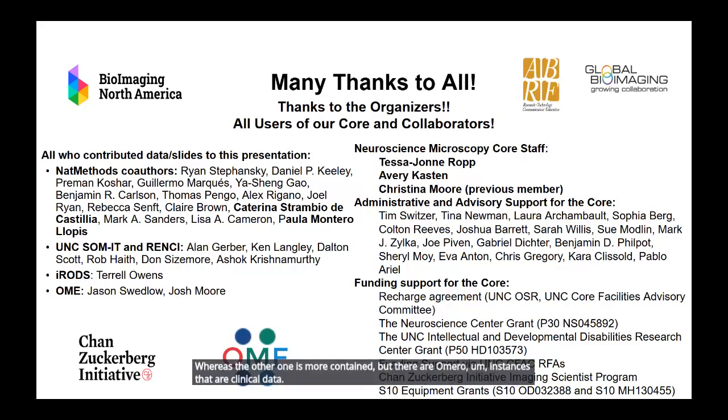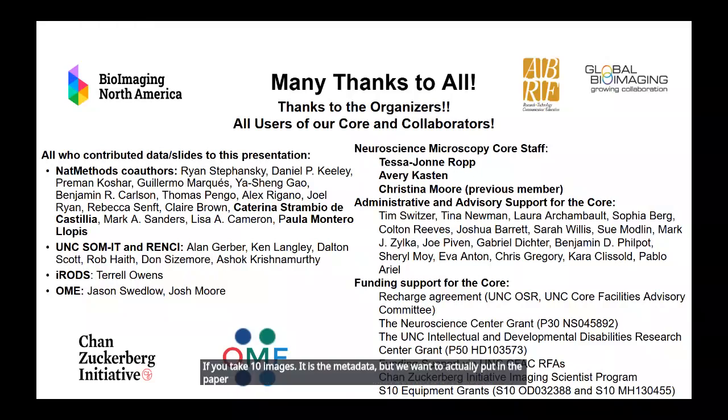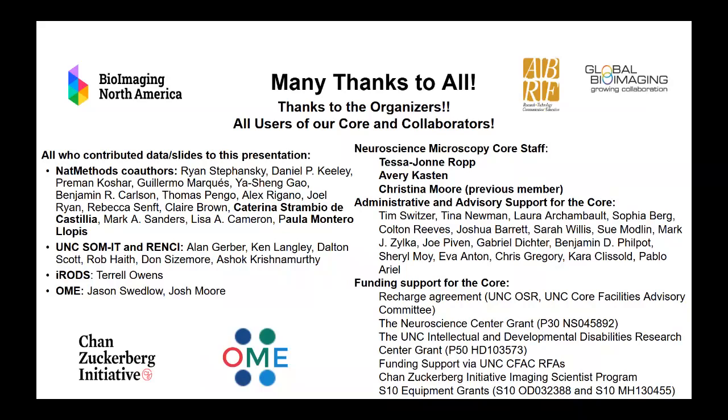Okay, another question from the audience. Perhaps wondering how this works, all these microscopes, you get 10 images. Is the metadata that we want to actually put in the paper embedded in each one of the images, or could you talk to the manufacturers and have them agree on a standard where there's a file inside that could be put into Omero or Dataverse? It just seems like that's the time to capture that information.